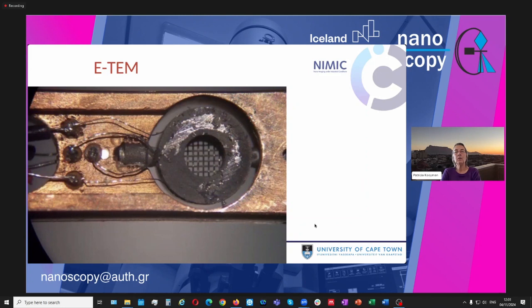But what we saw is that this platinum heater ring of the holder was completely covered in a very thick layer of soot after the experiment, which means that, even though we did see the carburization of the iron oxide, what was clear from this result is that like 99% of your carbon monoxide is actually reacting on your heater and not on your catalyst.